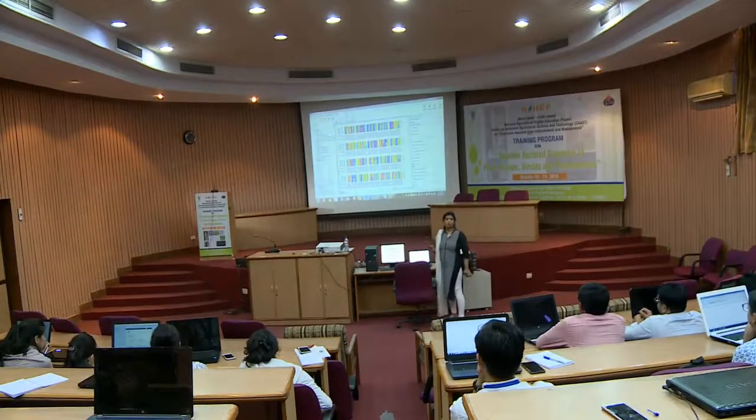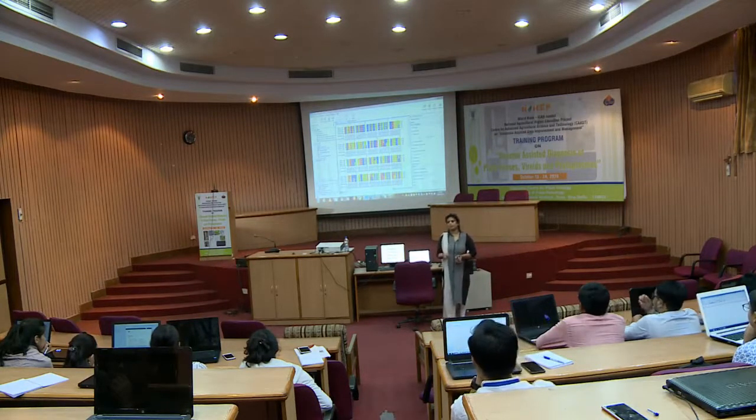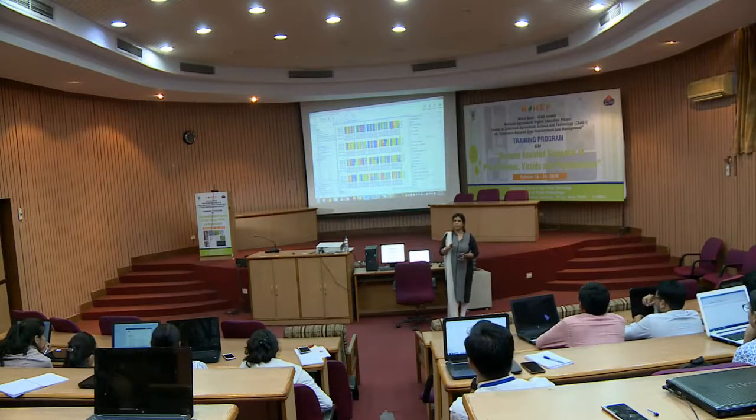So, this is how we have prepared our file for GenBank submission. This is the nucleotide form of that file. Okay. Now, should I move further or do you have any query? You can point it out right now only, otherwise you will get confused.